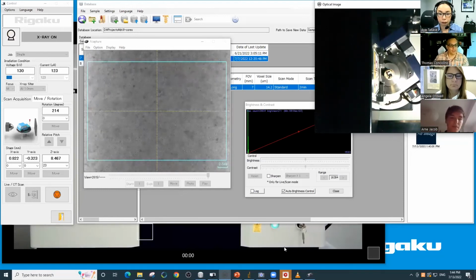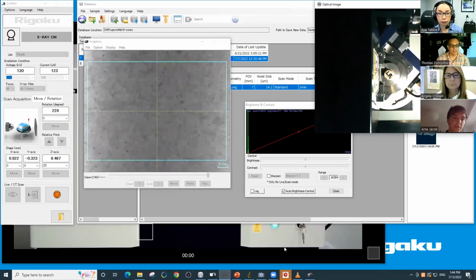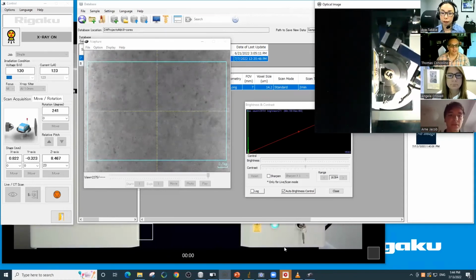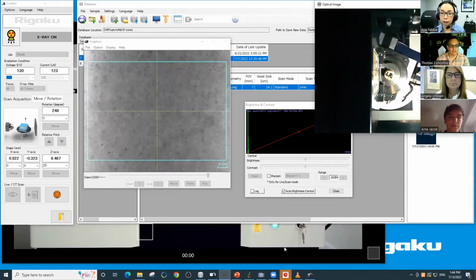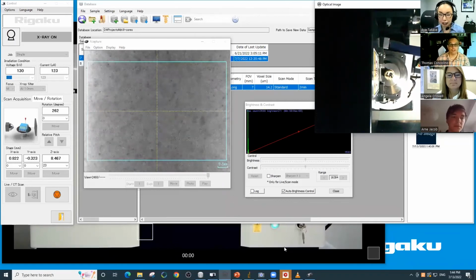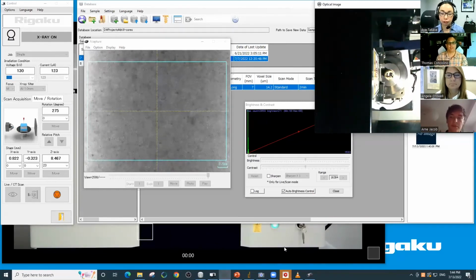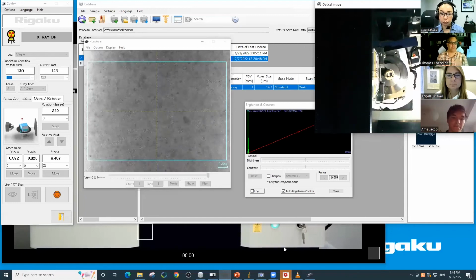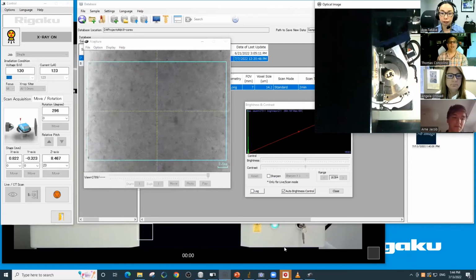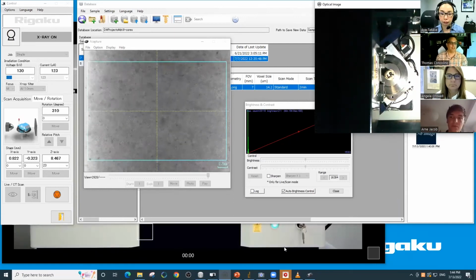Okay. And then there was an earlier question that was answered, let me see if I can find it here. Here it is. I'm sorry. Converting from 16-bit to 8-bit. So asking if you lose a lot of information. And again, I saw Arn answered that in the chat. I wanted to give him an opportunity to make sure everybody got a chance to understand what happens when you do that. Arn, if you want to answer that, I know you know the answer too.